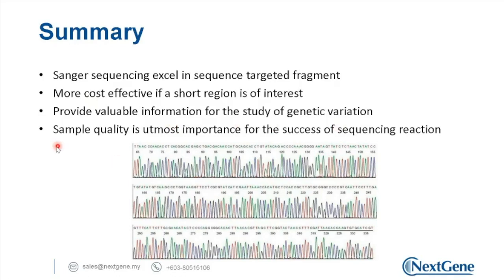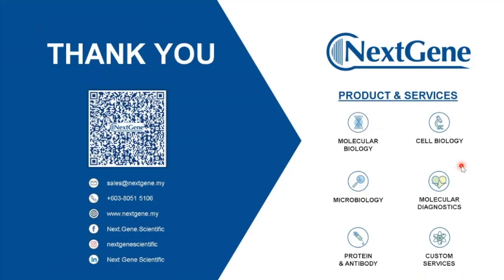However, the take-home message that I would like you all to have is that sample quality is the most important thing for Sanger sequencing to be successful. With this, I wish that everyone will get very good sequencing results for your project. Thank you.